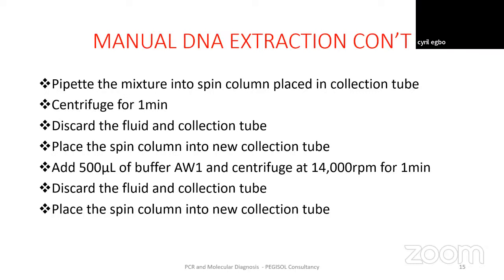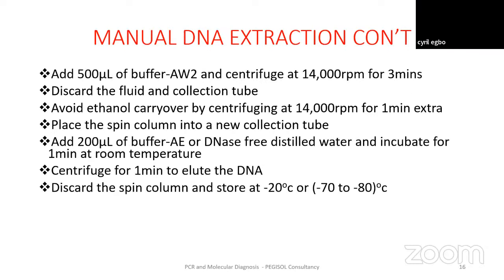Then after adding your buffer AW2, you centrifuge at the same 14,000 RPM for 3 minutes. Then you discard the contaminant that is collected in the collection tube.